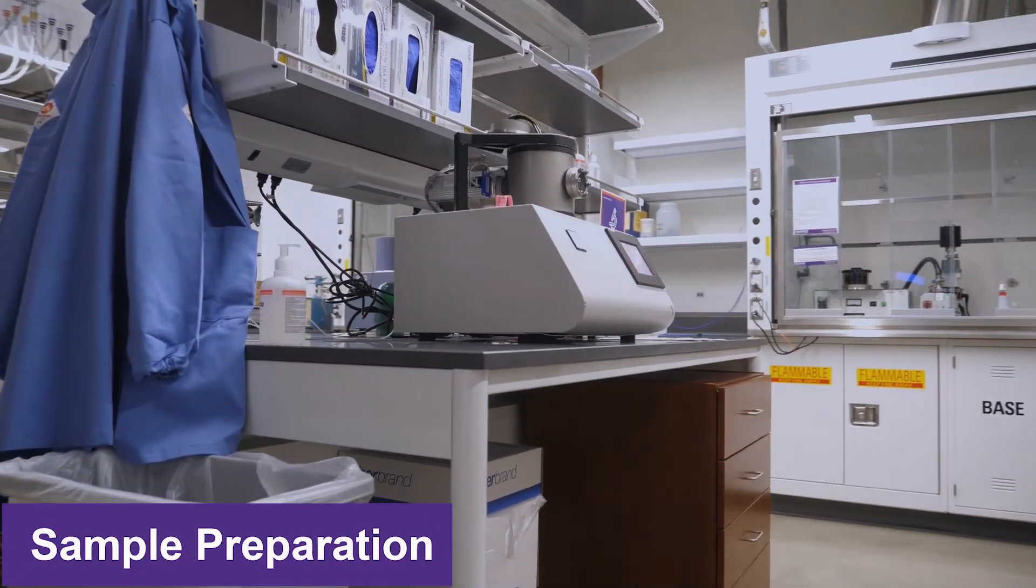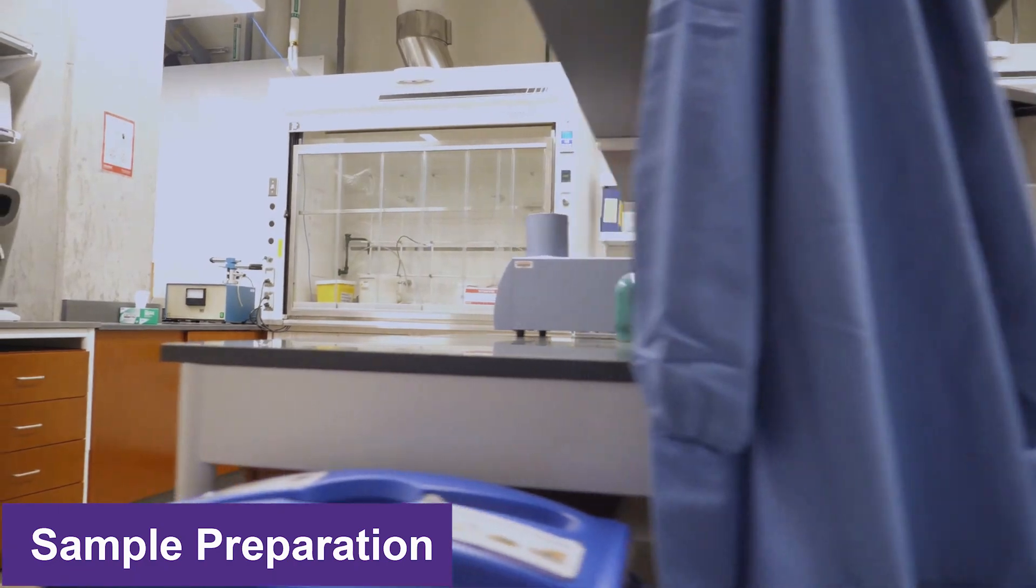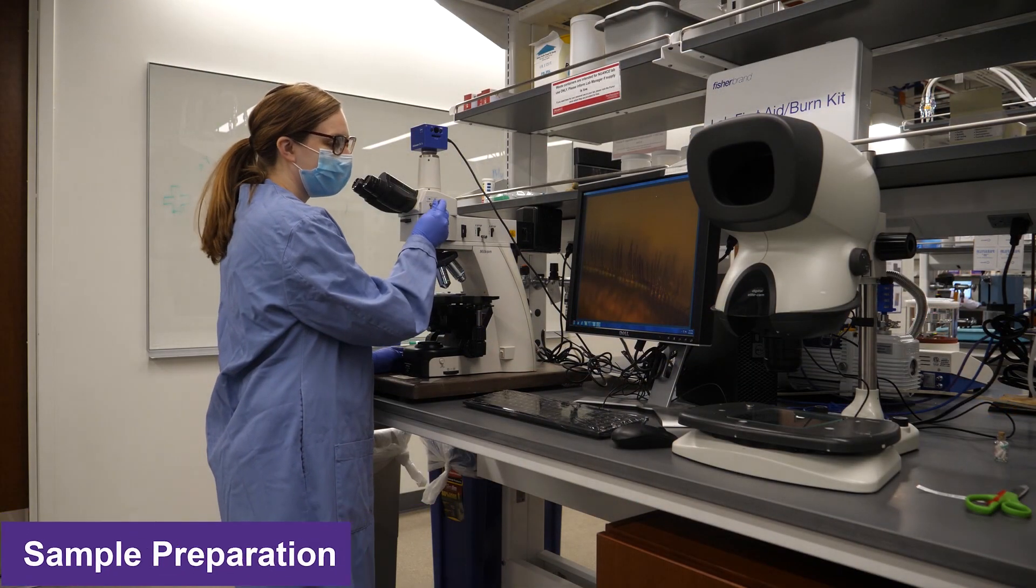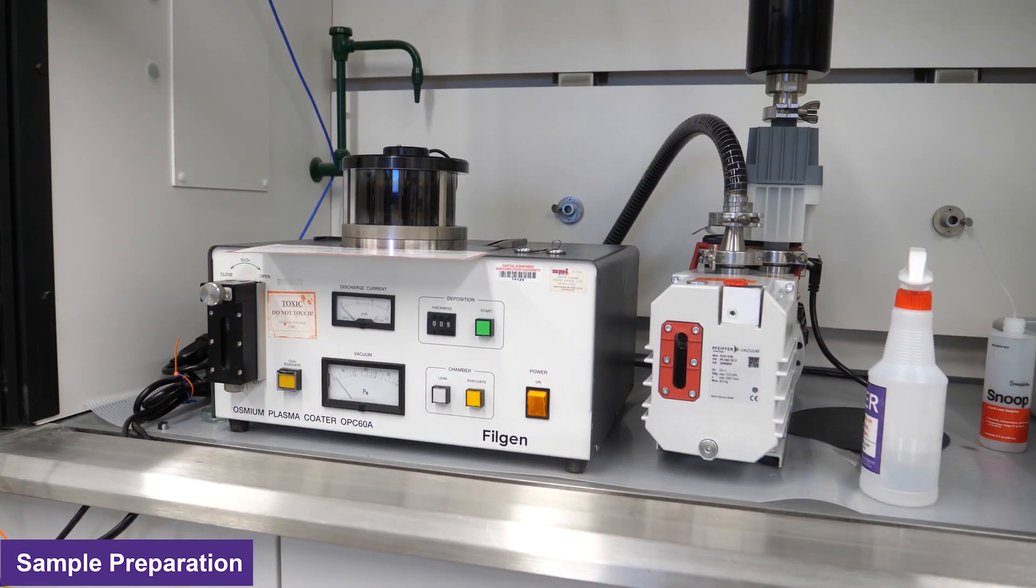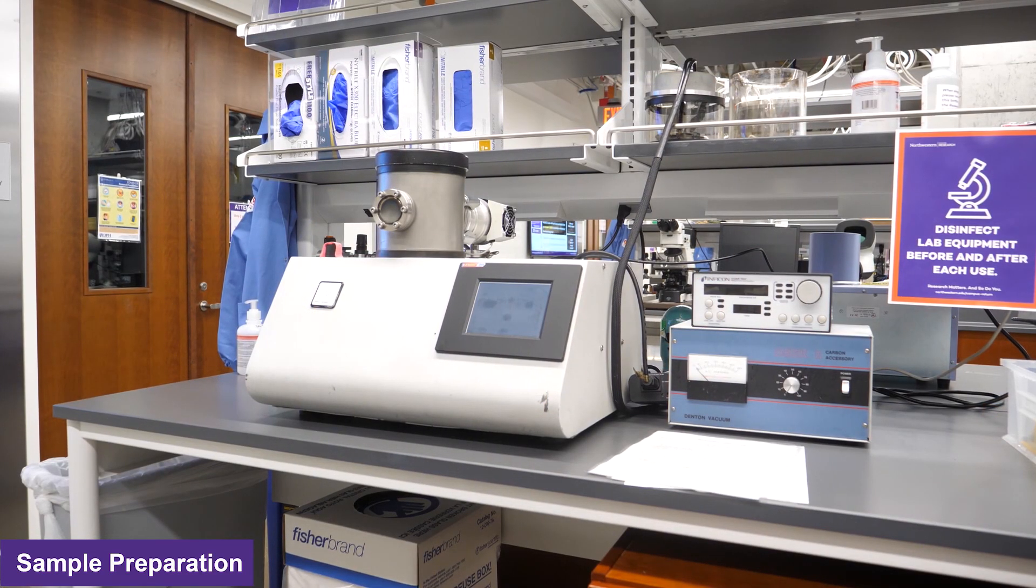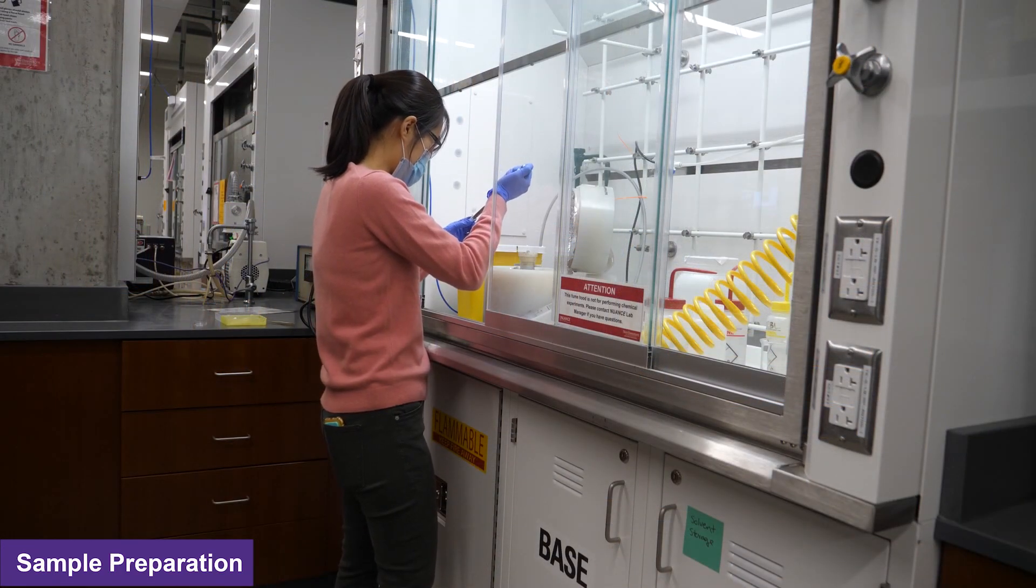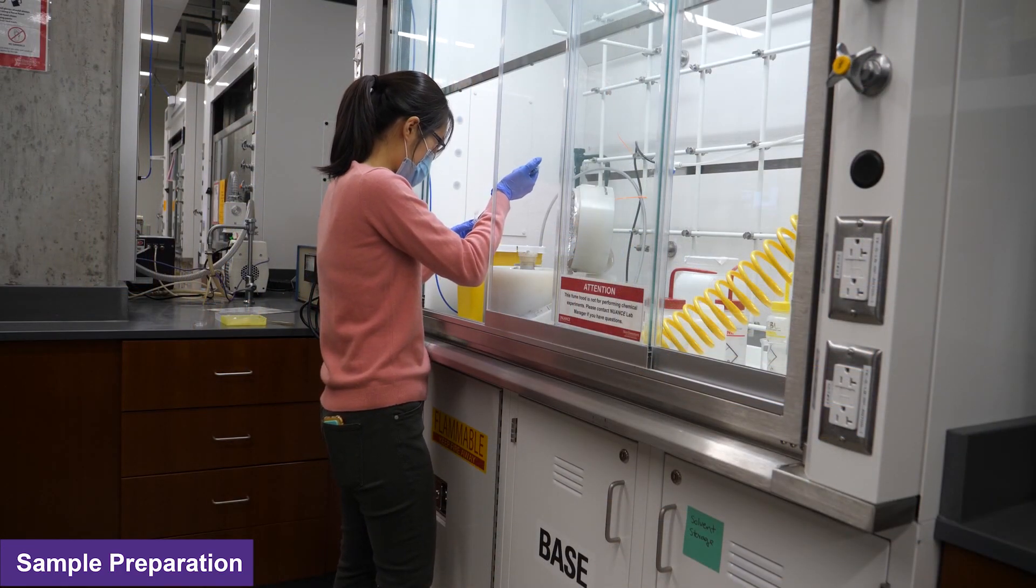All of the EPIC SEM lab sample preparation equipment can also be found on the ground floor of AB. In this lab, there is an optical microscope, an osmium coater and a sputter coater for adding a conductive layer to a non-conductive SEM sample, and a spin coater dedicated for depositing resist for the EBL process.